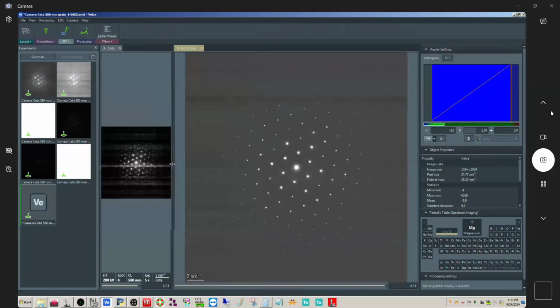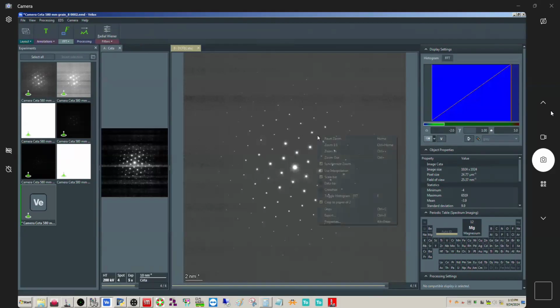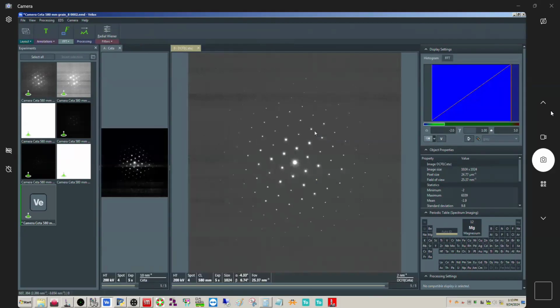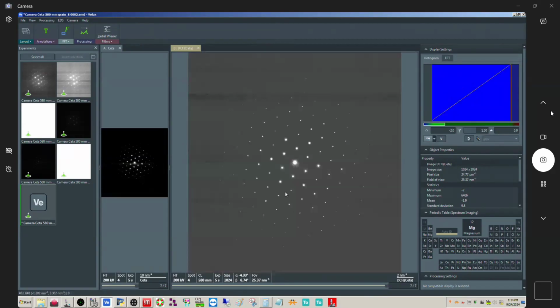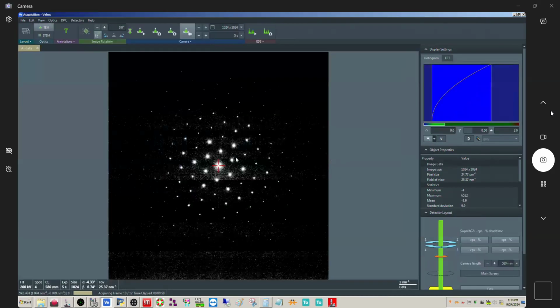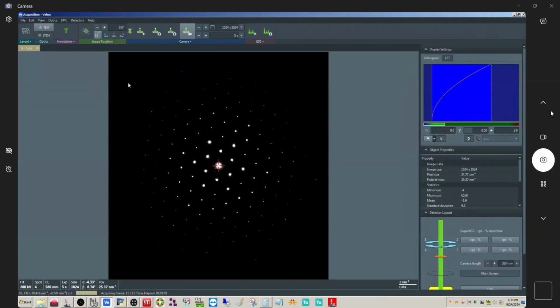And you can see by integrating the frames, we're already getting a better looking result. I don't know why it does this, but when you do this, it puts the gamma to 1. So you have to put this, oh, sorry. Whoops, what's going on here? But this is the same as, okay, so we're basically, are we done here? Oh, we're doing 12, that's right.